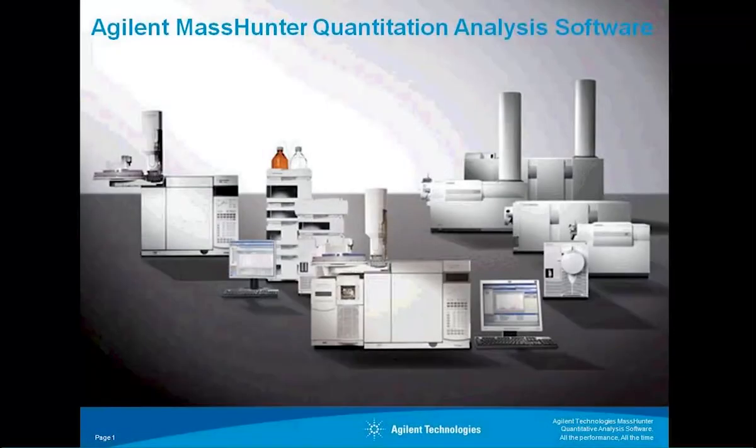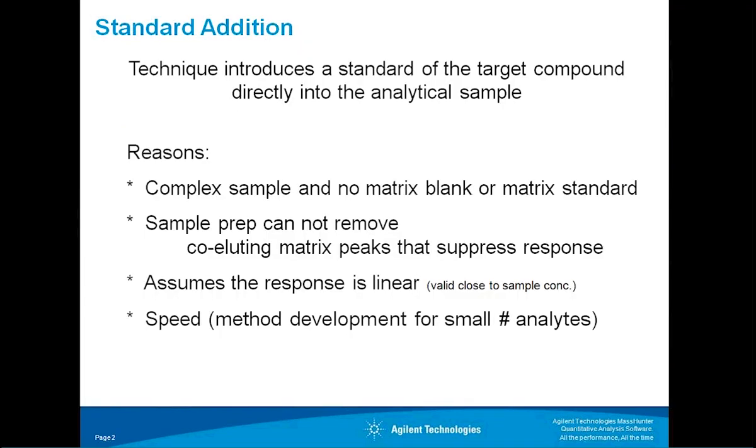I'd like to welcome you to a discussion of a new quantitation feature, Standard Addition. So let's discuss what the reasons are for turning to Standard Addition. First, Standard Addition is quite different than creating a calibration curve from calibration samples. The technique actually introduces the target compound directly into the analytical sample. So, a very different methodology.